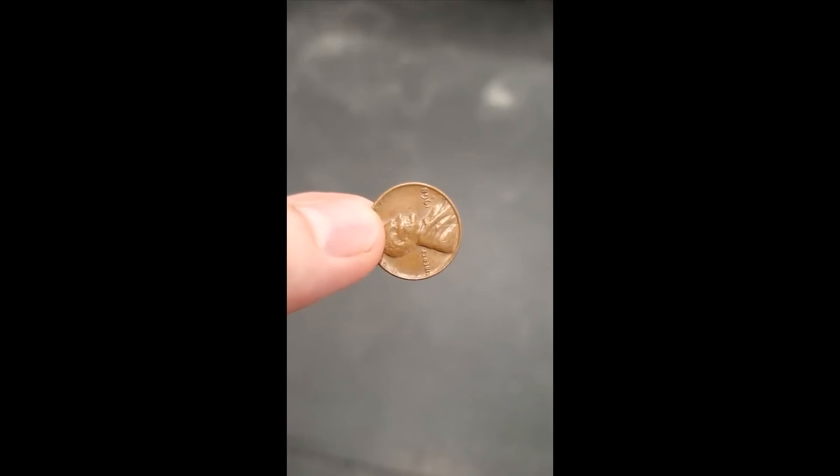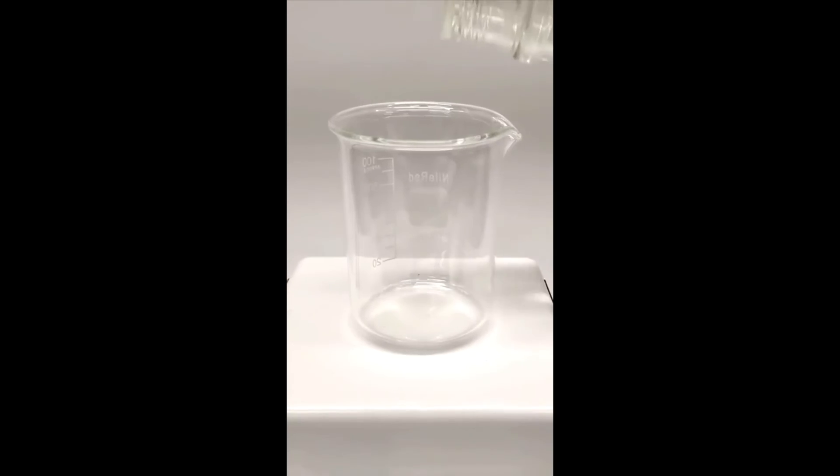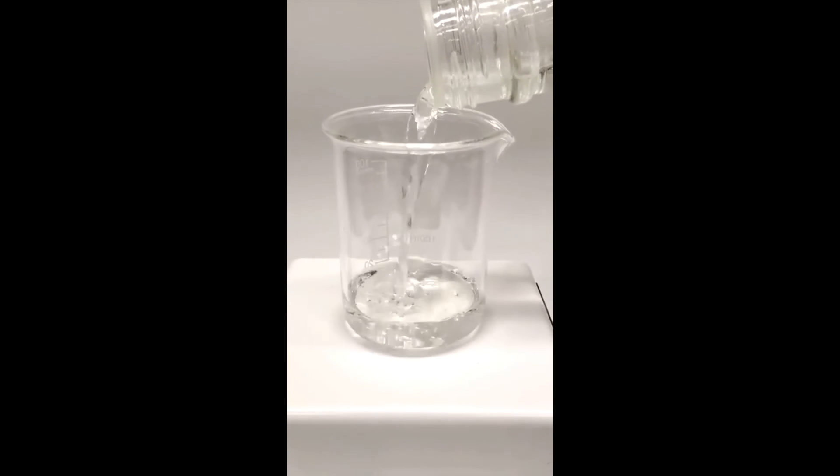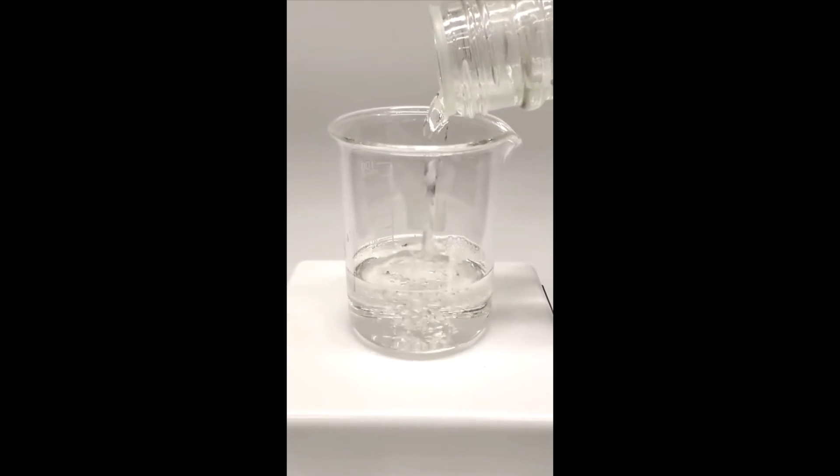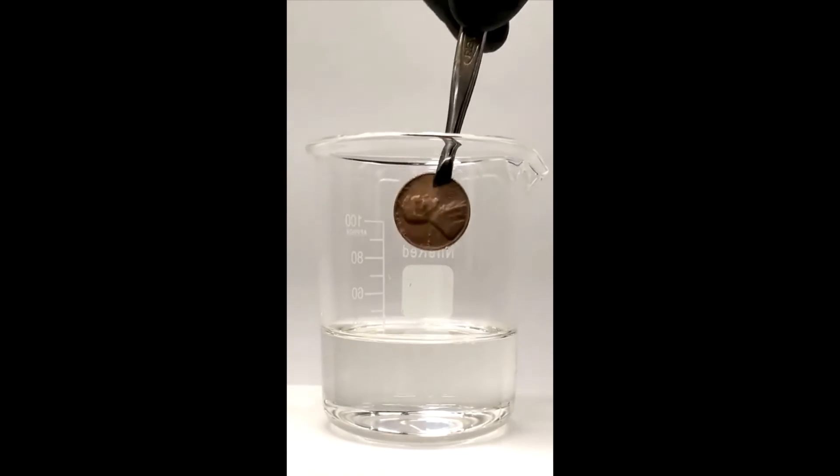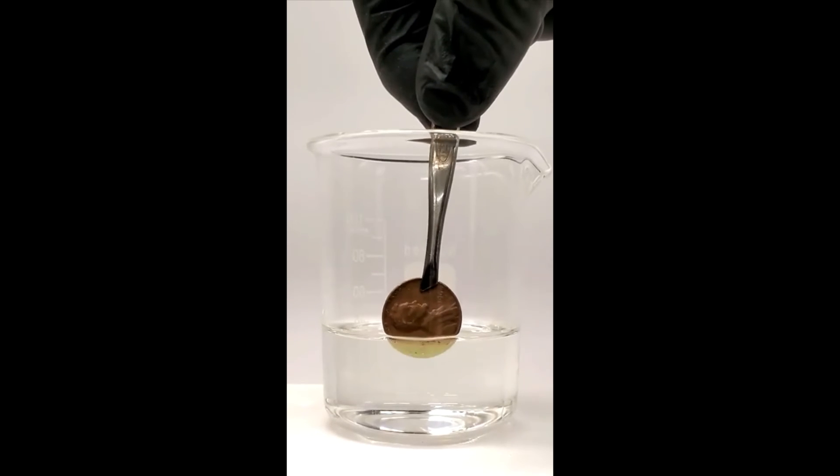So today I'm going to be destroying this poor penny for no reason. To do this, I just need to add some nitric acid to a beaker. Now if I put a penny in, it immediately starts eating it.